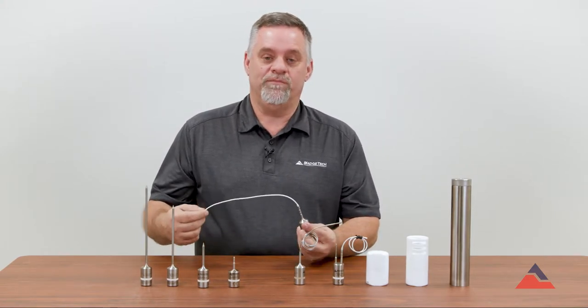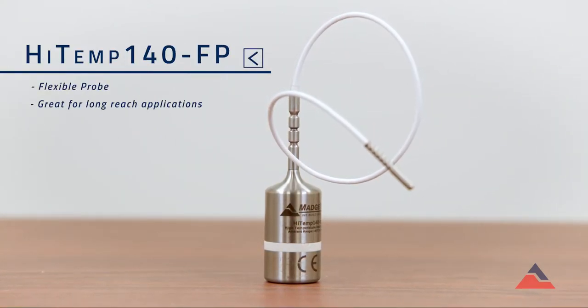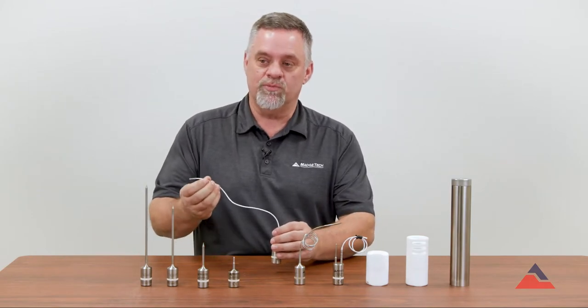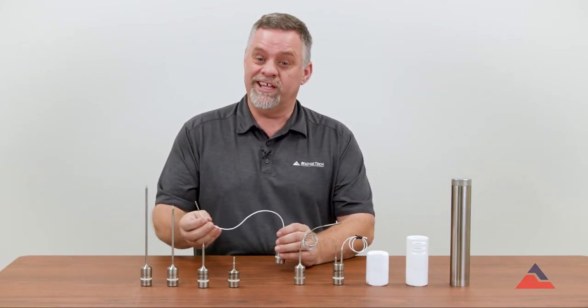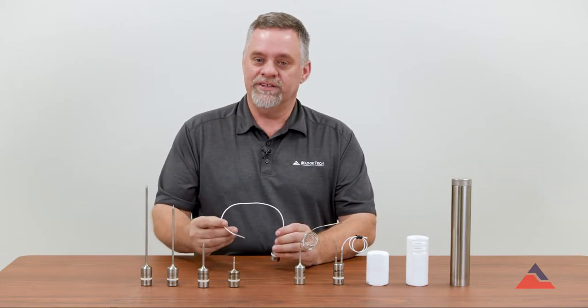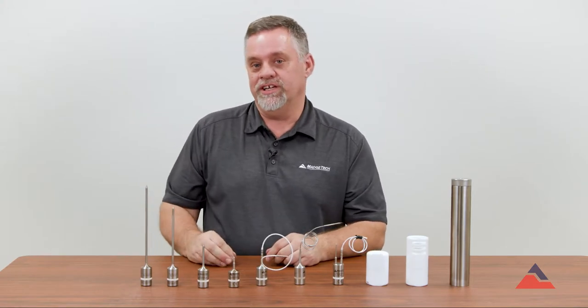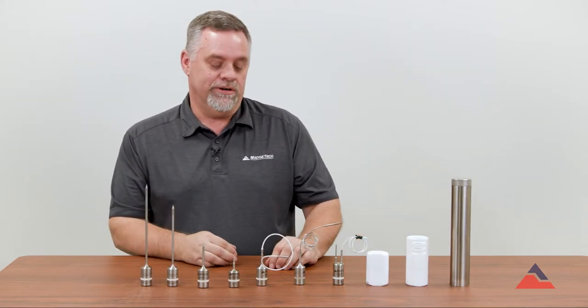The HITEM 140FP is fully submersible and can go through that autoclave cycle. You can place the flexible probe into a pouch or somewhere else where you think it's not getting up to temperature, just to validate that every spot you're sterilizing is hitting that temperature and time needed to kill all those bacteria.